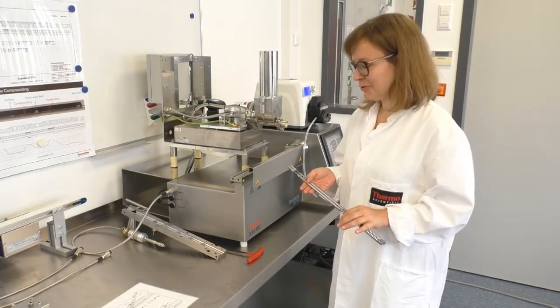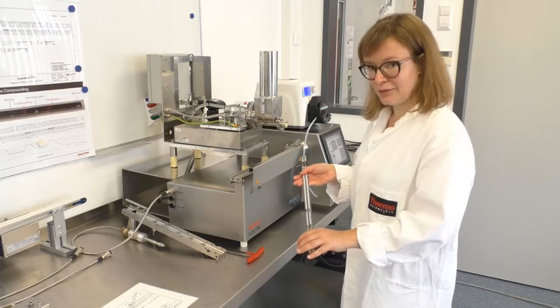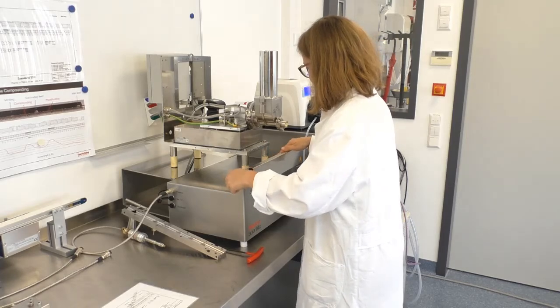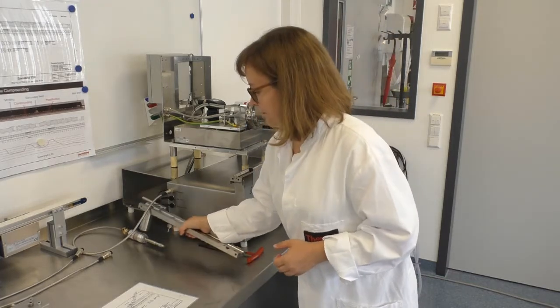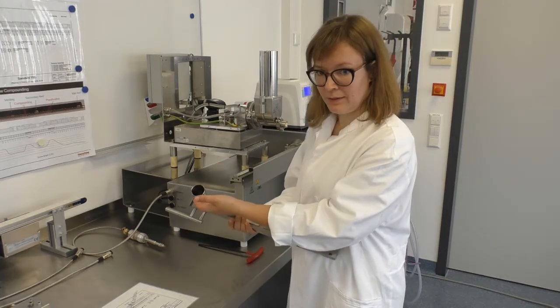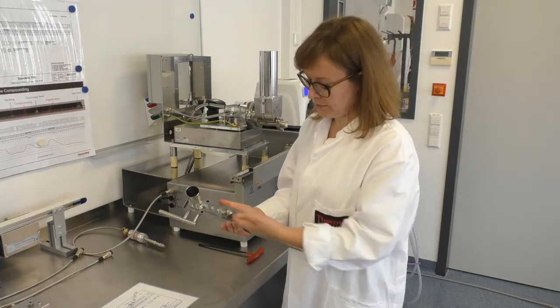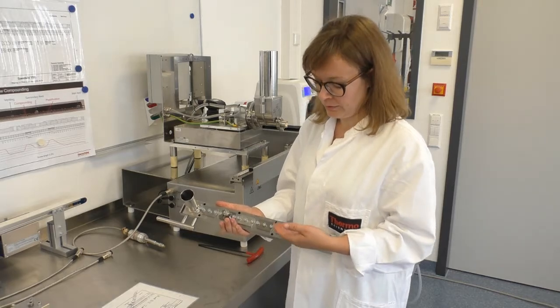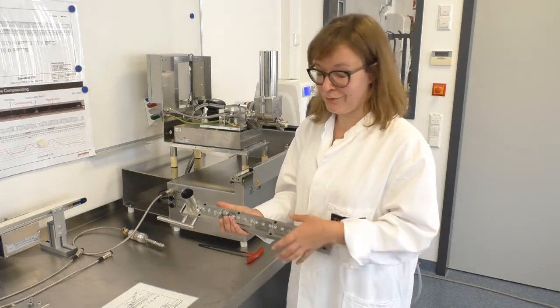So now I want to show you how we assemble all these parts together, and then we will start with the process itself. First of all, I'll place these two co-rotating screws into the extruder barrel. Like this. And then as the next step, I place the upper barrel part, which you can see here, which has the feed intake part here at the beginning and the liquid feeding port in the third part of the barrel. As you can see also, we have a fully ported barrel design, which means that you could also at a later stage of your process install another liquid feeding port, for example, for feeding oil or colors or whatever you can think of.